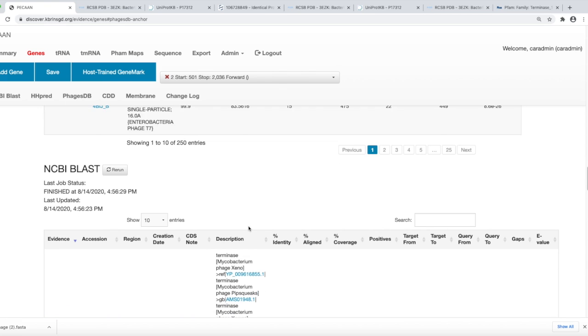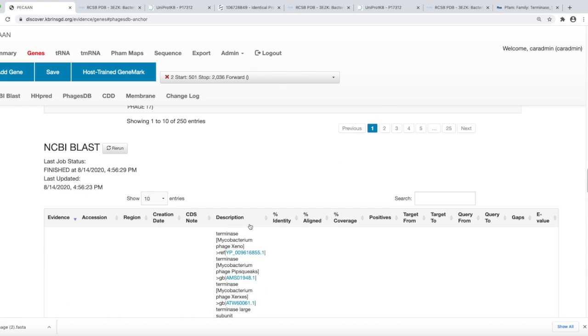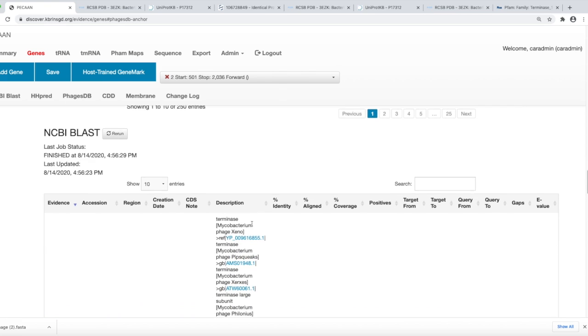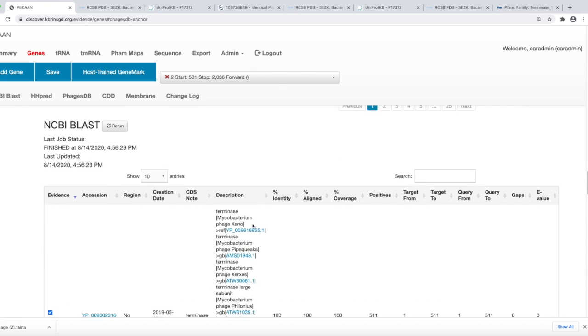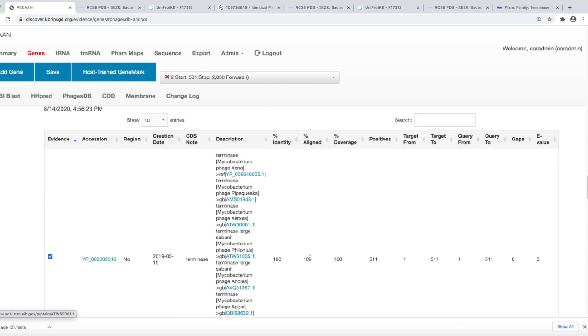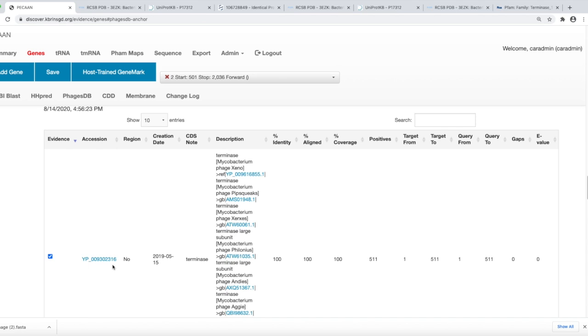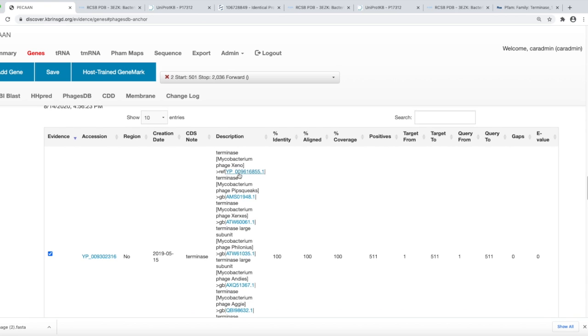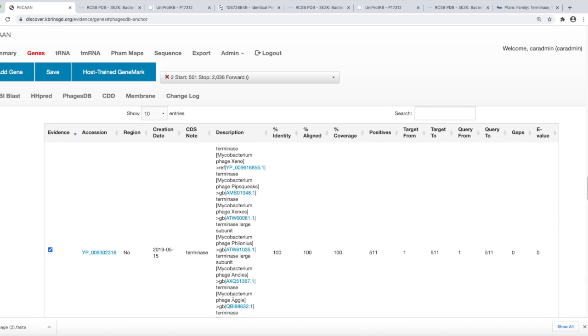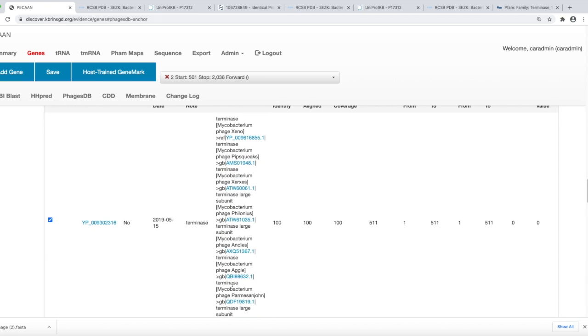Come down, you can look at the NCBI database. We've looked at this a little bit as far as the target from target 2. We see it matches the N very well. We've found 100% identity match here.